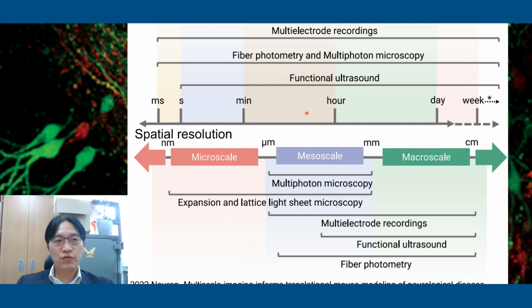For that, multiphoton microscopy or miniscope have a good temporal resolution within a second duration. And for the spatial resolution, you can go from a nanometer to beyond a centimeter. But for this scale, I think the single unit is about 10 micrometers.